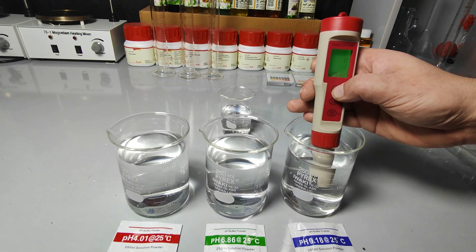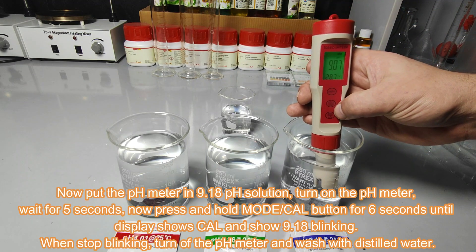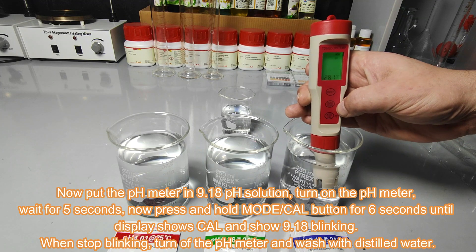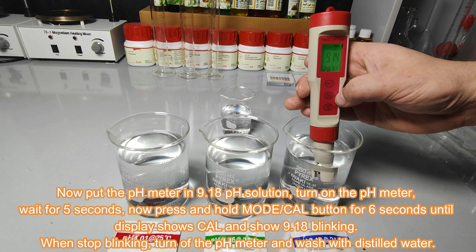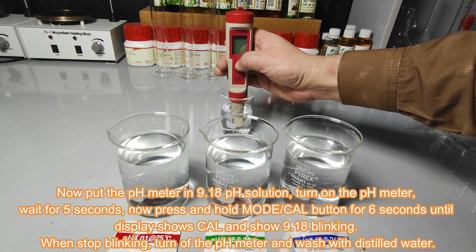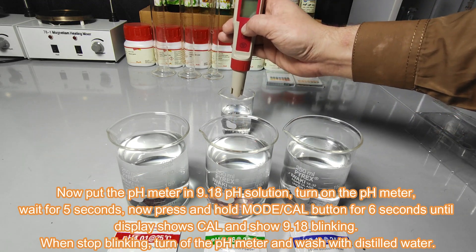Now put the pH meter in the 9.18 pH buffer solution and turn on the pH meter. Wait for 5 seconds and then press and hold the mode/cal button for 6 seconds until the display shows 'cal' and shows 9.18 blinking. When blinking stops, turn off the pH meter and wash with distilled water. Now the pH meter calibration is complete.